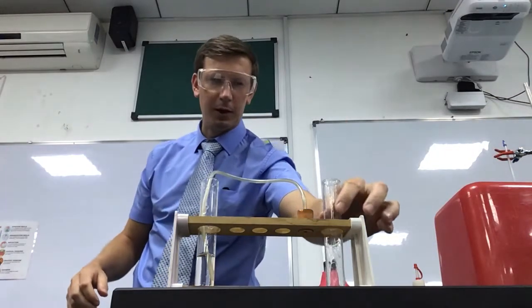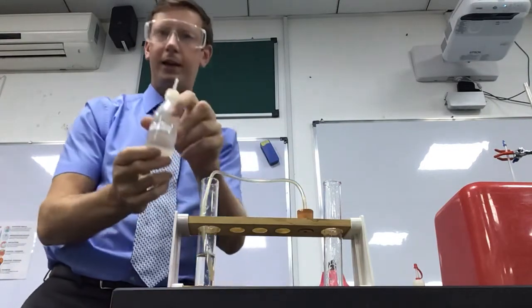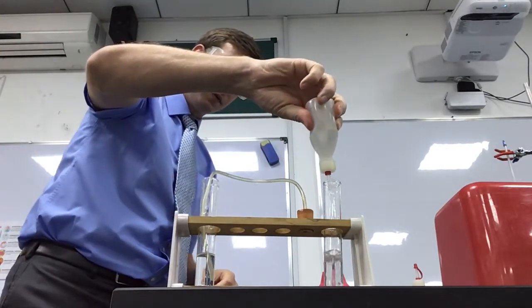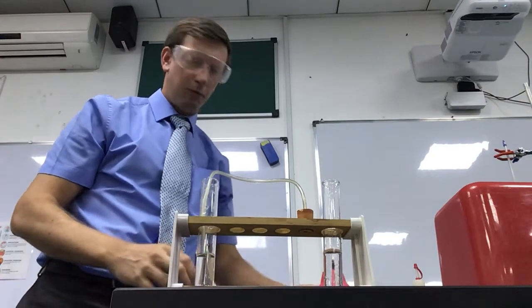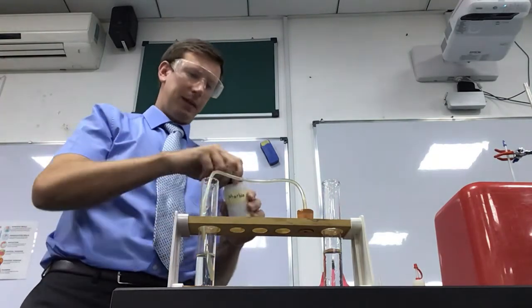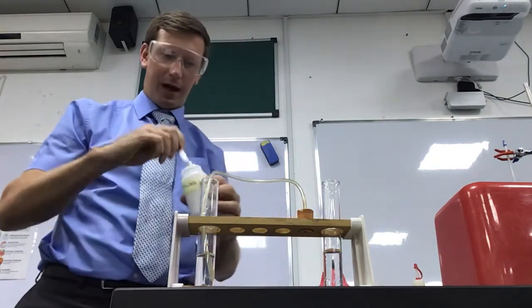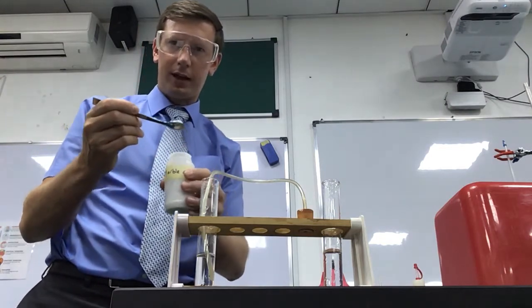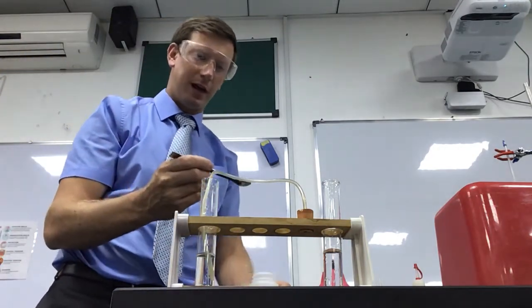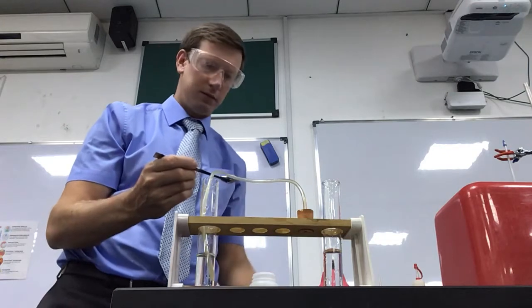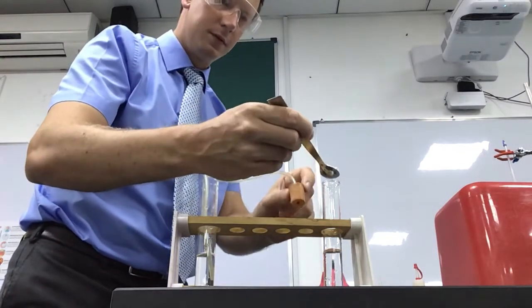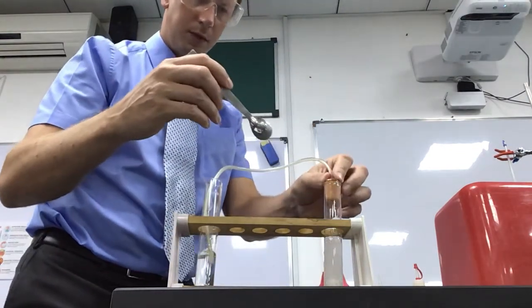In my second experiment, I'm going to take hydrochloric acid, HCl. Again, one molar. But this time I'm going to react it with marble chips, also known as calcium carbonate. They're not a powder. They can be a powder. You can get them powdered. But these ones are chips. Very small bits of what look like rock, because they are. And now I'm going to pour these in. Put the lid on.